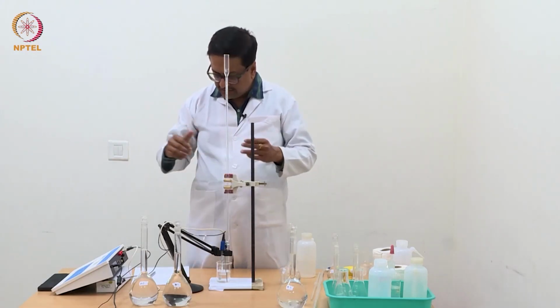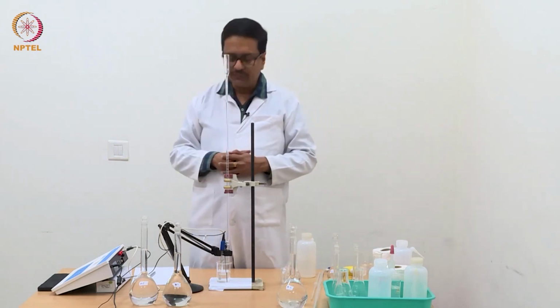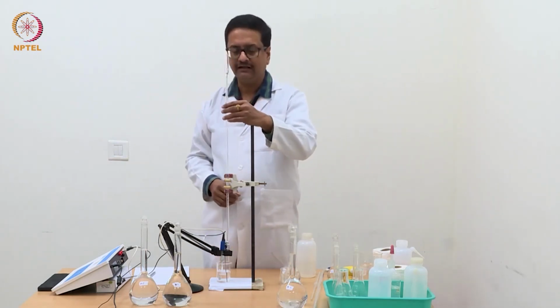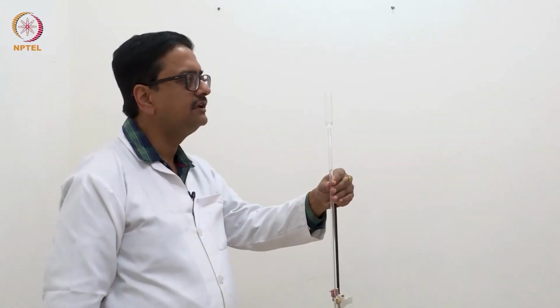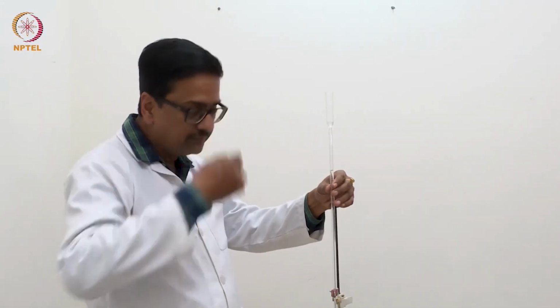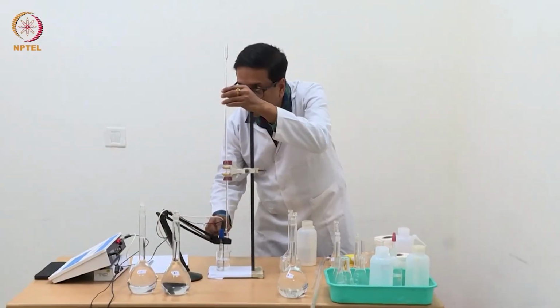And we are nearing a point where there may be a sudden jump, so we should be more careful and add small amounts every time as usual, let the electrode equilibrate and then read the correct pH when the equivalence point is reached.